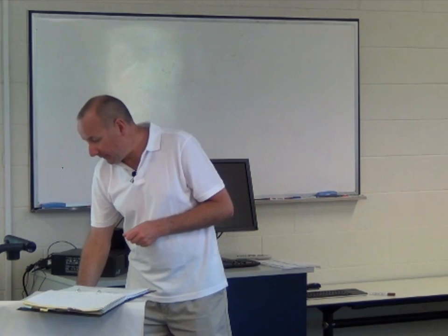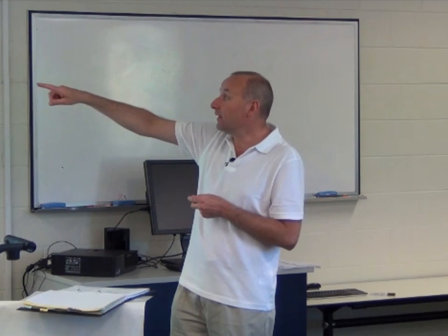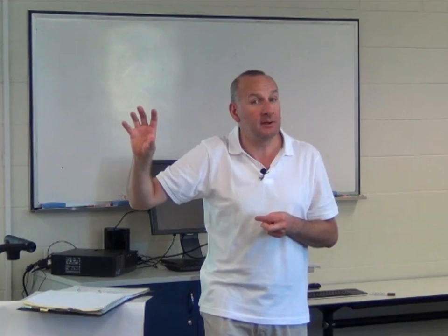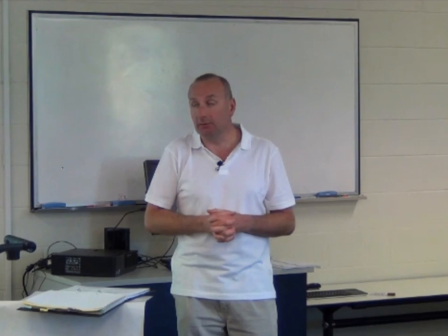Now, there's just one thing we need to worry about. And remember, that is because we're doing this in the inverse mode. So the I spins typically are proton, and the S spins are typically carbon-13. And of course, the majority of the I spins, the majority of the protons, are not coupled to any carbon-13s at all. So all those pulses to the S spin don't make any difference to those protons. And those protons will just come blasting through that first part of the sequence and give you a very strong signal in the spectrum. And that signal will contain no useful information because those protons are not coupled to carbon-13. So we really have got to suppress the signal from the protons, the I spins, that are not coupled to the carbon-13, that are not coupled to the S spins.